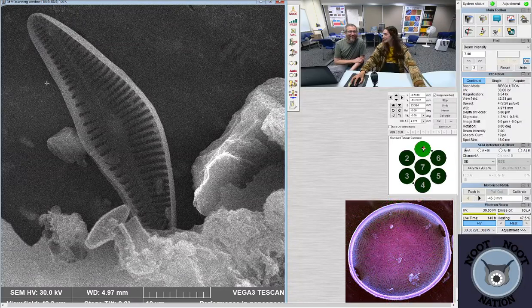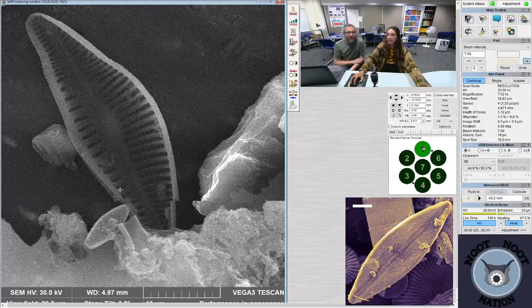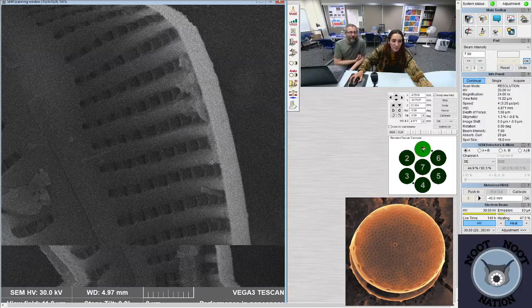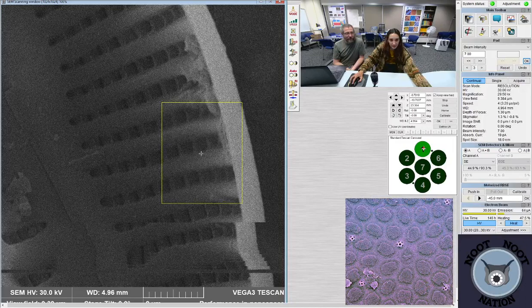This one's a Cymbella? Encyonema. Because of the ends? That's how you tell. Also, I can just tell from the shape. Because of the belly, right? Encyonema look a little bit different to me. Just eyeballing it. But if you look at the valve, the terminal ends of the raphe will show you that they deflect ventrally, which means that it's Encyonema. Or, as I usually tell my students, it's making a poopy face.